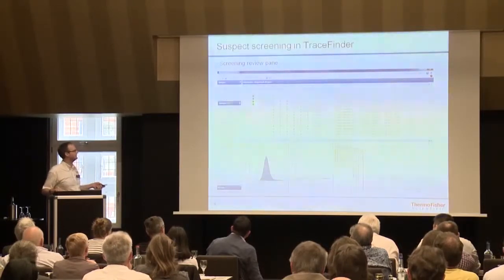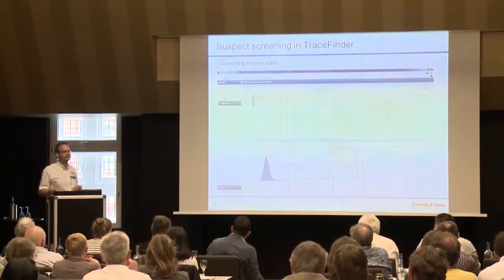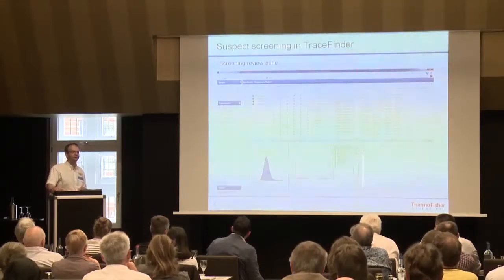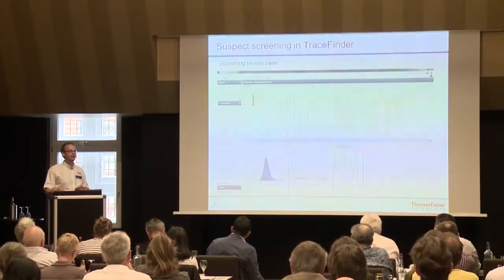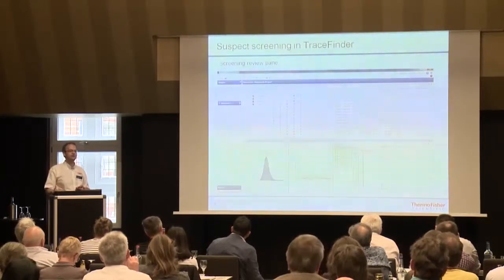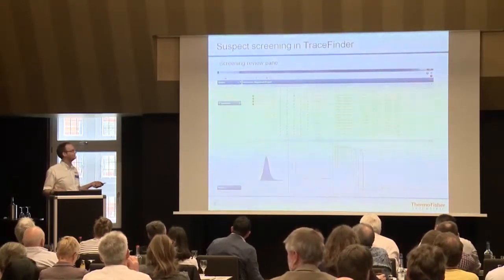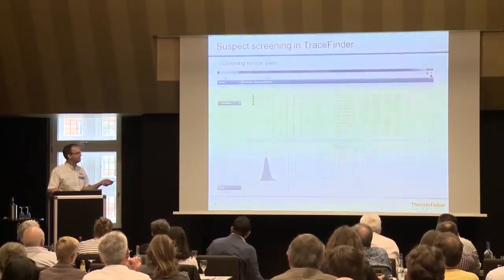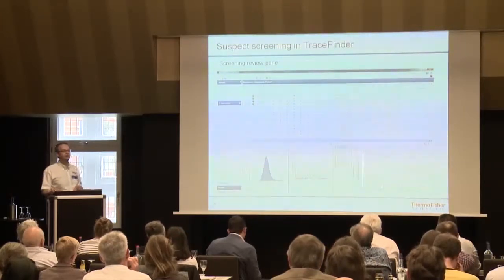So the software is still saying quant peak, although we are not quantifying. The difference between such a screening and a quantitation is only if you run a dilution series of standards and qualify them as calibration standards or not. If you don't have quantitation standards, it's a screening. If you have quantitation standards, it will be a quantification, and you will get even a content number somewhere in the back of the table as well.